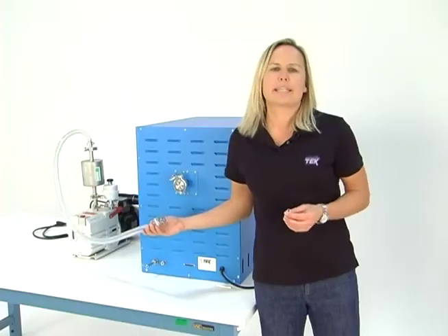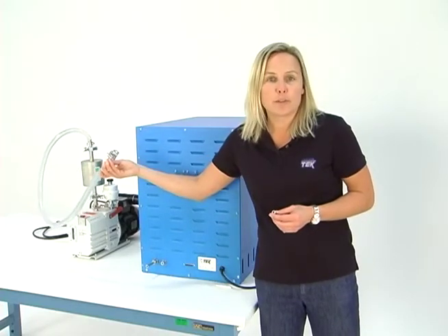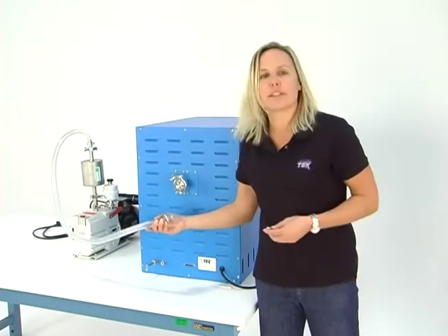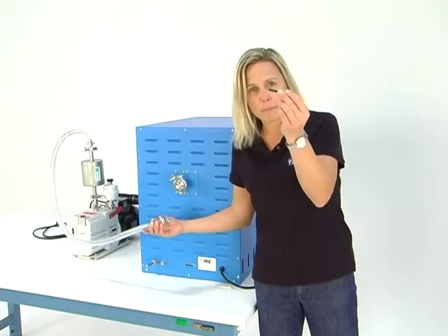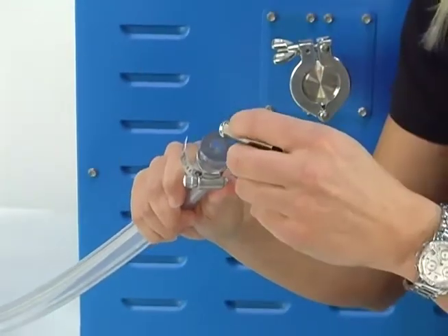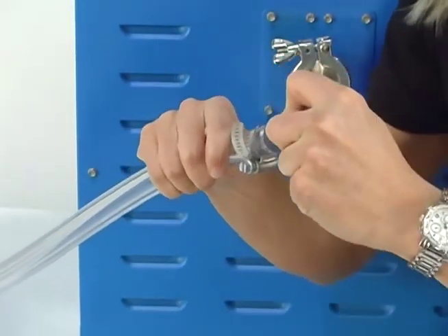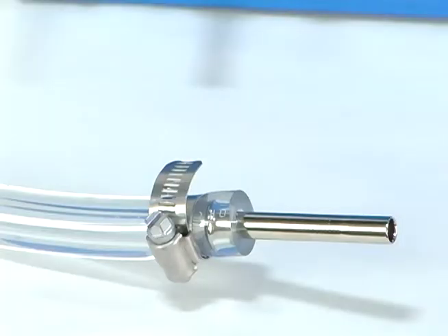Now we're going to connect the opened end of the vacuum hose to the TVO2 vacuum oven itself. Grab this larger barbed insert — see the barbed end? Stick the barbed end into the end of the hose. There's a crimp clamp here for you to tighten it down and get a real good tight seal.